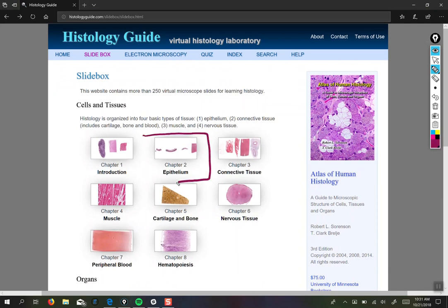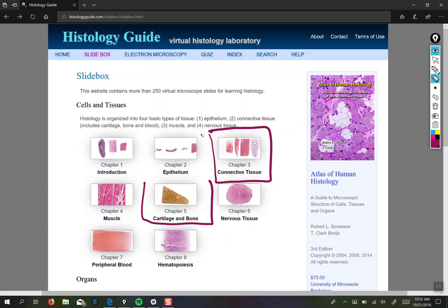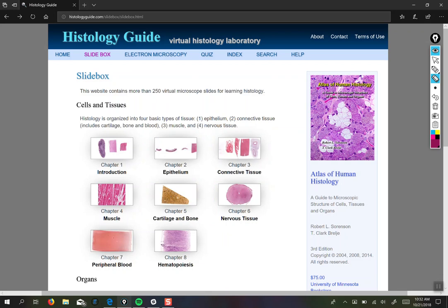We have epithelium and connective tissue, and you are responsible for knowing some subsets of those tissues. We should also include cartilage and bone as well. Technically cartilage and bone are connective tissues, but here they have been separated out. So these are the three we're going to be going through today. Let's dive in.